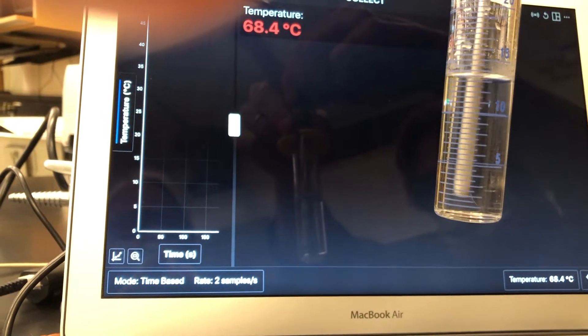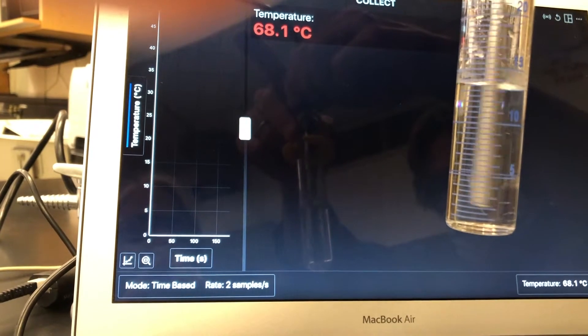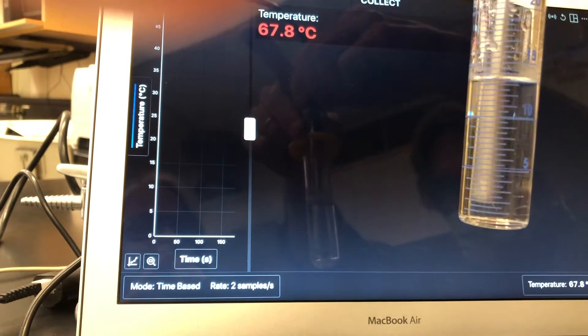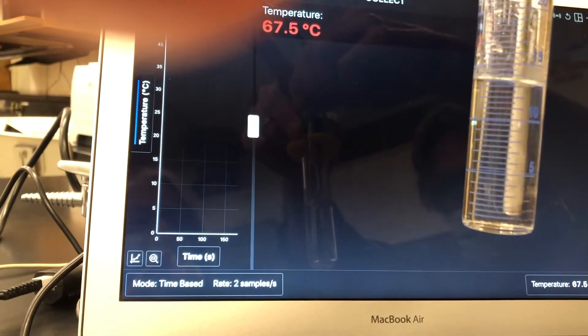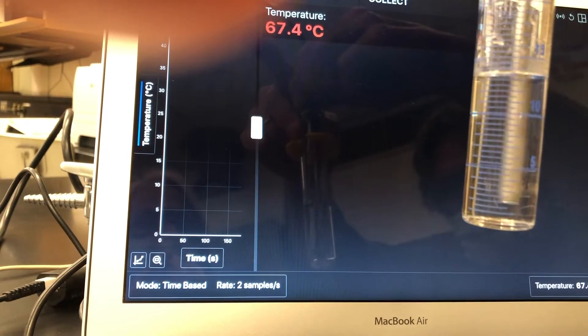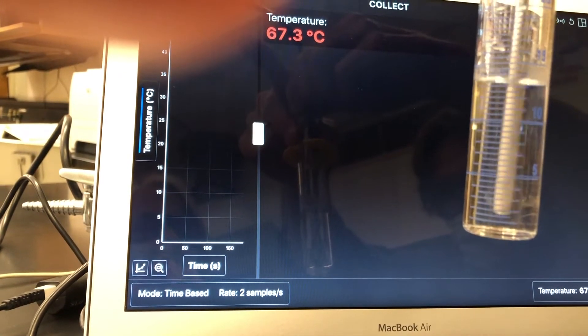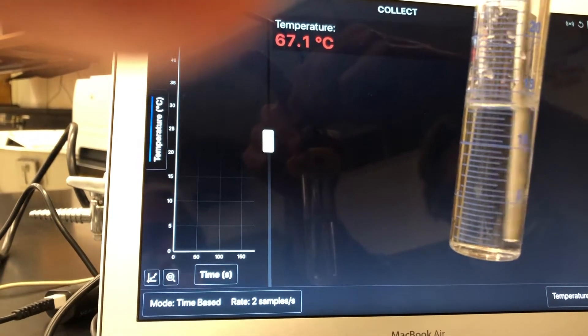If you're uncertain, you can always pause the video and rewind it a bit. That's the benefit of recording this — you can go back and make the observation if you partially missed it. I'll let it go for a while and leave it up to you to determine the temperature at which crystallization starts to occur.